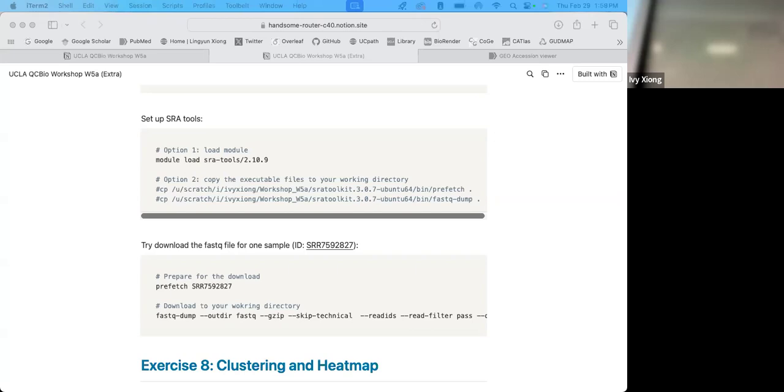Okay, right, yeah, so I saw the window. It's kind of funky. I've never seen that before. So hope you're done with that. Just exit, click on X. I think that would do. So it doesn't need to be configured. So what did we do? I think once you've seen that page, it's configured.